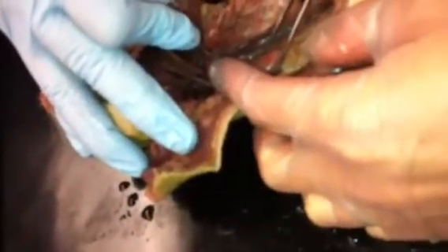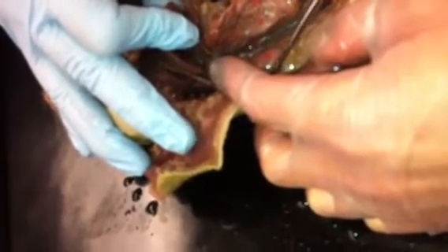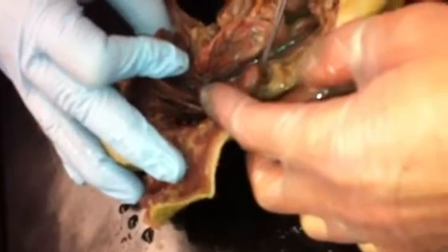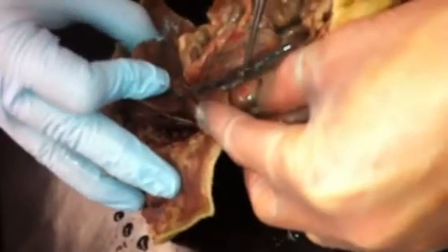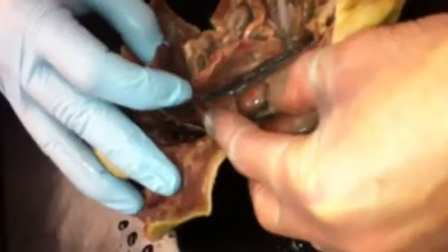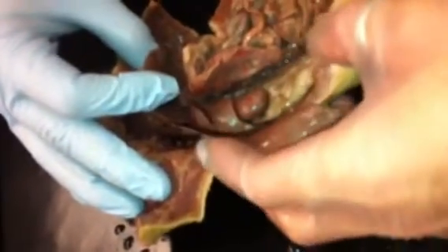And then the kidneys are right there, and they're behind the peritoneal space, so they're embedded in tissue. A little bit later, you guys can actually just excavate the kidneys out like that, so they're a little bit more obvious. And we'll try to find the ureters, which are also embedded in this tissue, but we have to excavate them out in order to see them. And this is the right kidney, and then the left kidney will be on the opposite side.